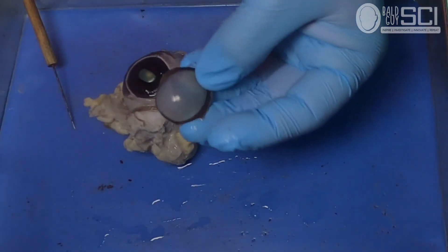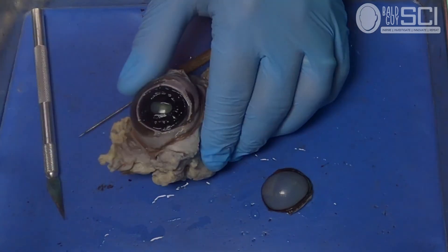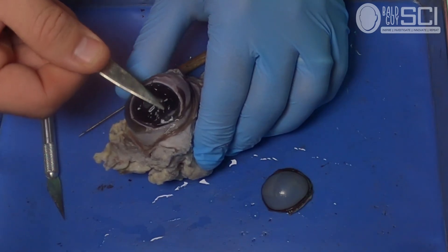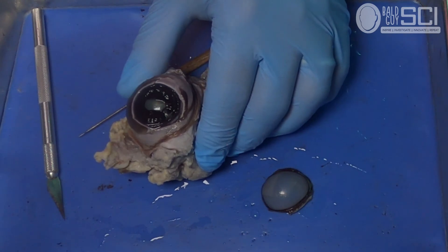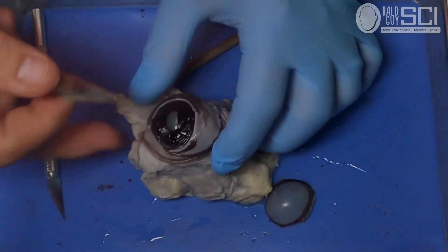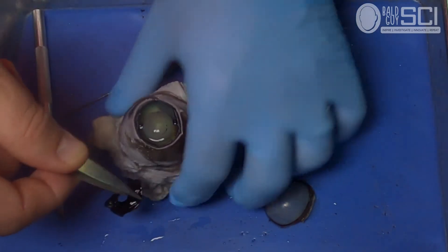Now you can see that the cornea is clear, and then we're looking at the iris and the pupil. The next part is we're going to remove the iris. You're going to slide underneath with a pair of tweezers or forceps and pull. My advice is to not try to pull the whole thing out at one time — move about a quarter of the way around and slowly work your way around, and eventually it will come off.